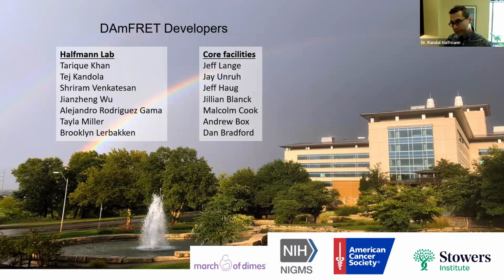And what we showed in this paper is that based on this pattern of mutations that inhibited the transition, and you may be familiar with this from the paper, we found there was this parity dependence. When we introduced mutations only at odd positioned intervals, we were able to form amyloid fine. When we introduced them at even intervals, we blocked amyloid formation, provided we did that at a high enough density. And that tells us a feature that's only explained by beta conformation, in a beta strand. Yes, beta conformation.